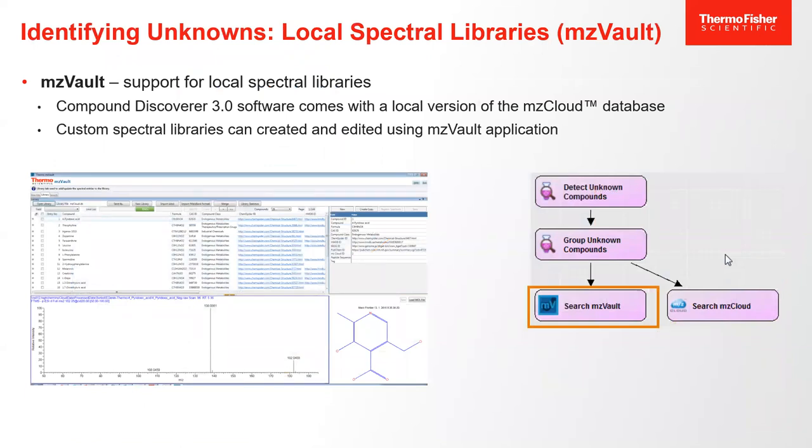Okay, now, local spectral libraries. This is when we want to move from the grad student completed their paper to the grad student wanting to make the next graduate student's life easier, okay? Where your research group builds up over time. Because what you want to do is every time you successfully identify something, you want to build that experimental data into the library, okay? So for example, here at U of F, I collaborated, okay? We purchased a little over 600 plant compounds unique to Arabidopsis, which are known important biological pathway identifiers, okay?